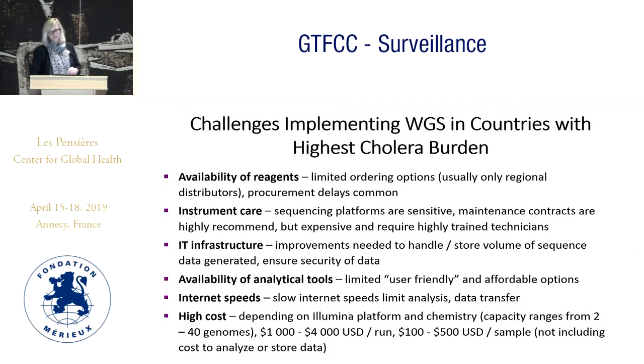So here's some of the challenges that we've come across while implementing WGS. Some of these are not anything new to this group. The availability of reagents is still a problem. Limited ordering options, there's usually only one regional distributor, if at all, and then the procurement delays are very common. Instrument care: maintaining the sequencing platforms is expensive, they are sensitive, and the maintenance contracts, which we highly recommend, are expensive, as I said.